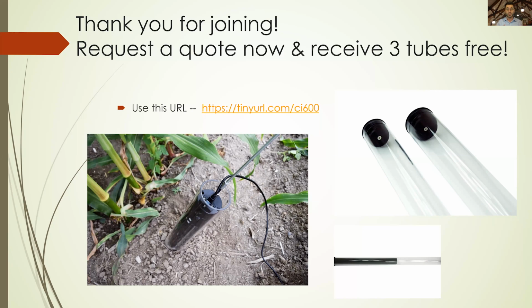So I'll give an example. If you wanted to do 100 DPI scans, honestly, in the work I've seen and the work of the researchers, you can get down to just a few seconds, 10 to 15 seconds, to do a full scan. And then the higher the DPI, definitely the longer the scan is going to take, but especially with the 602, the time has been decreased.